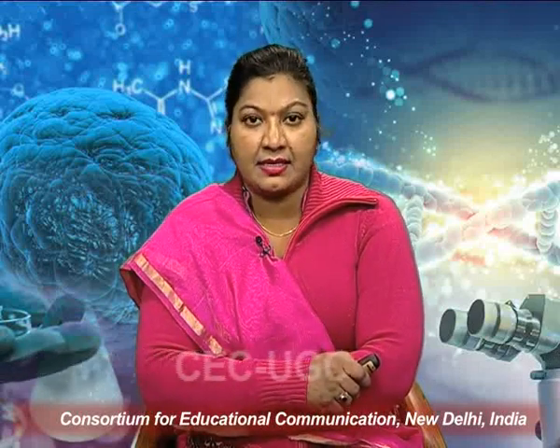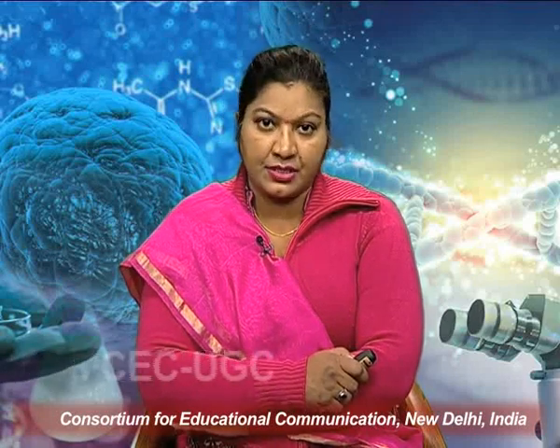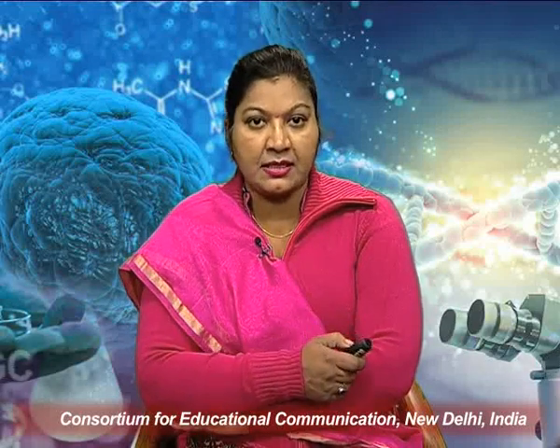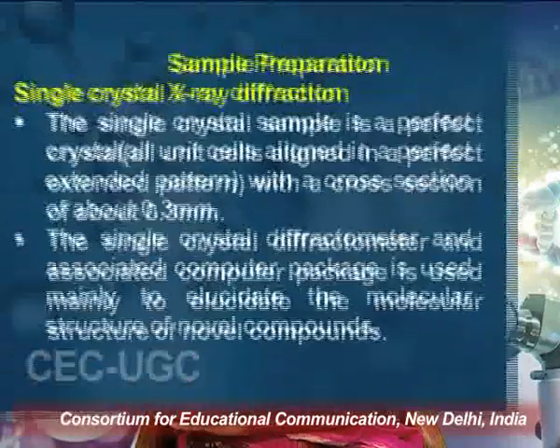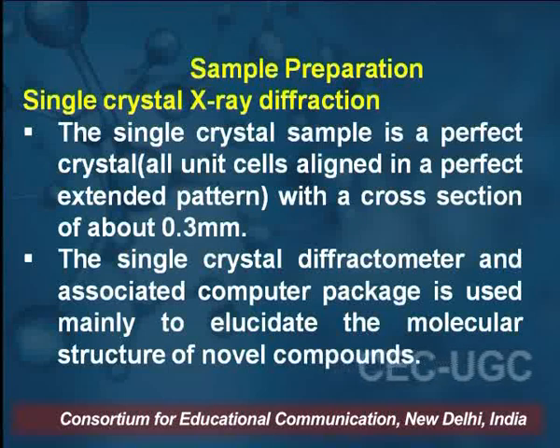Before starting the different methods, we discuss the sample preparation for characterization of the material. How we prepare the sample, and how we use the sample in the characterization. In the diffraction pattern we use 2 types, as the name suggests: single crystal X-ray diffraction. We use the single crystal for the diffraction pattern.